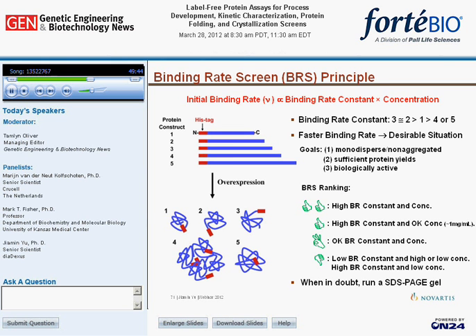Low binding rate constant, however, would give the construct a low ranking order regardless of the concentration of the soluble protein. And lastly, extremely low concentration of soluble expression would also give the construct a low ranking as well, regardless of its binding rate constant. When in doubt, you can always run an SDS gel to verify soluble expression level at the protein size. It is very important to mention that we are always comparing variants of the same protein in each project. Only then does the change in the binding rate constant reflect the impact of modifications made in the protein sequence. And different parent proteins have different binding rate constants, so you can't compare them directly. Next slide.